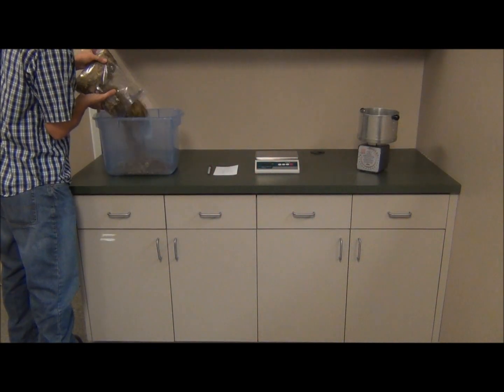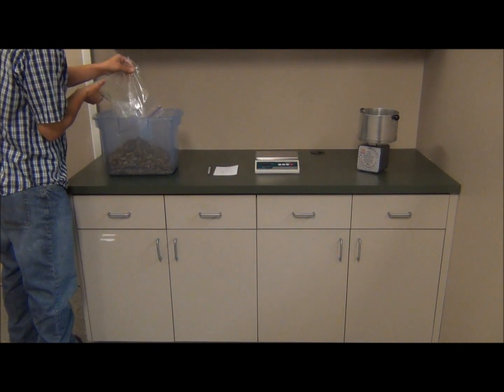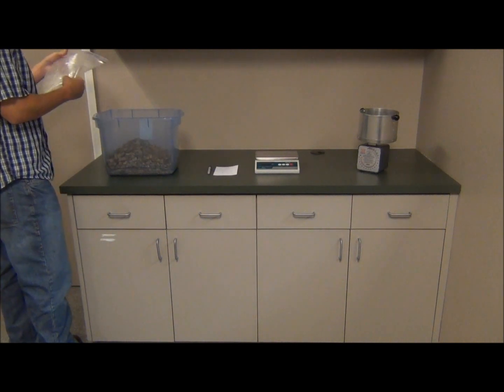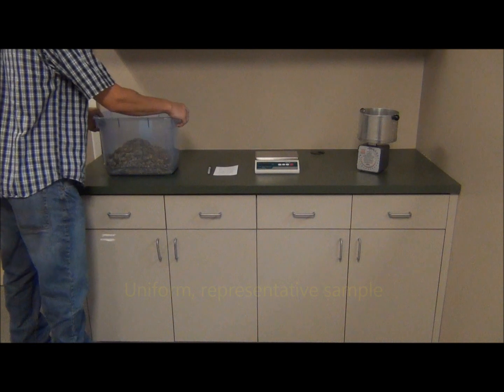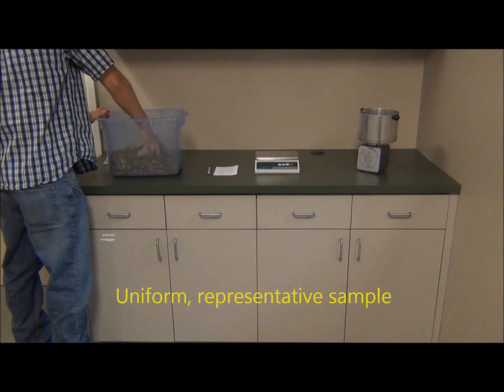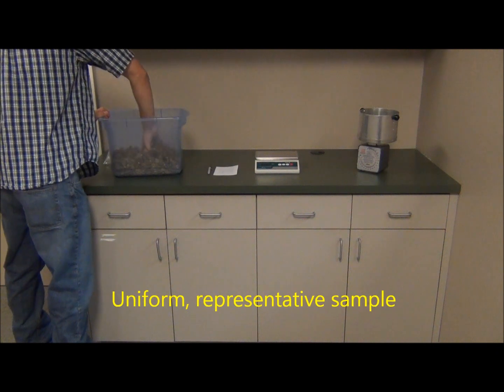Next, we will need to weigh out a sample of our product. Make sure that you have a uniform, consistent, and most importantly, a representative sample from whatever it is you are intending to dry down.